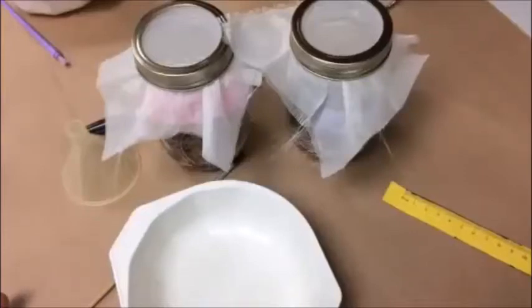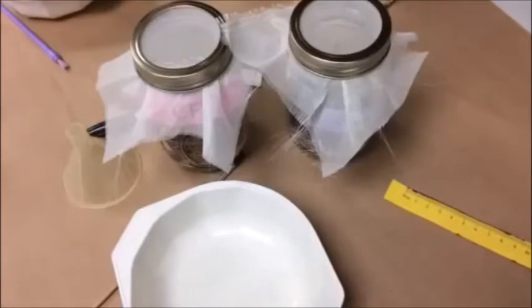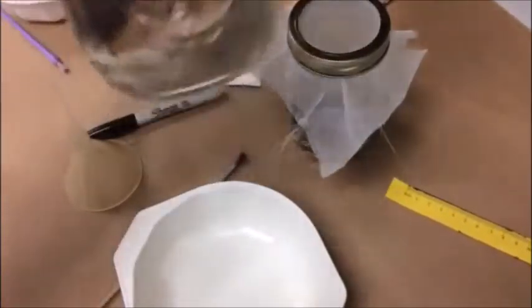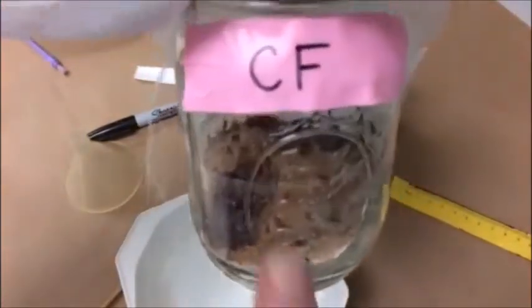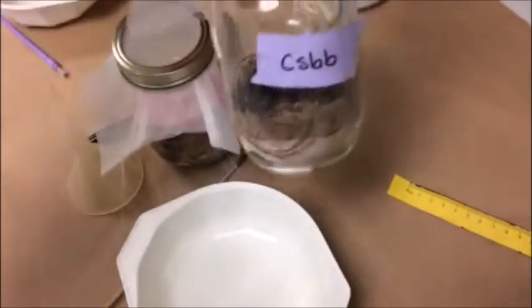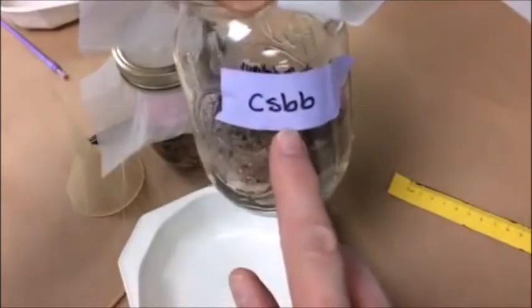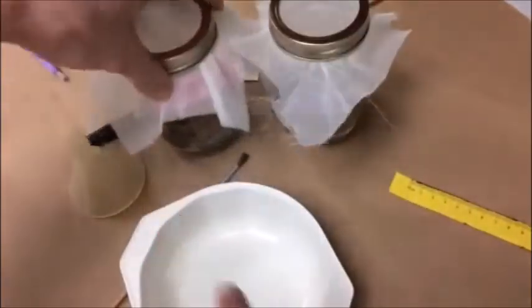Today I'm going to show you how to work with Tribolium beetles. One of the first things you need to pay attention to is that there are actually two different kinds of beetles. The red beetles are Tribolium confusum, abbreviated CF. The black beetles are Tribolium castaneum blackbody, abbreviated CSBB. So there are the black ones and these are sort of reddish brown.